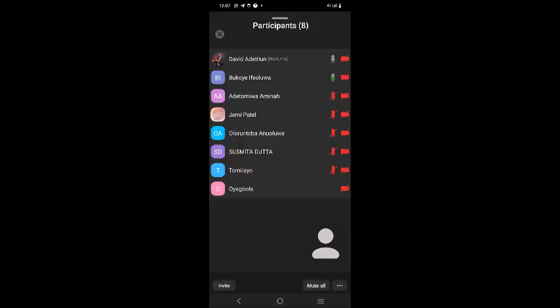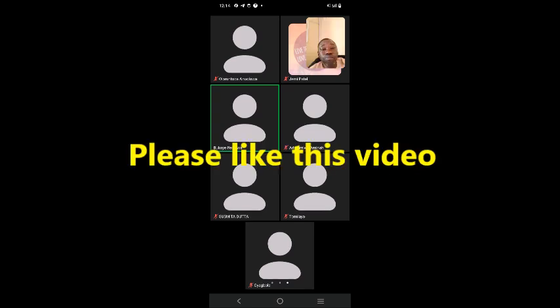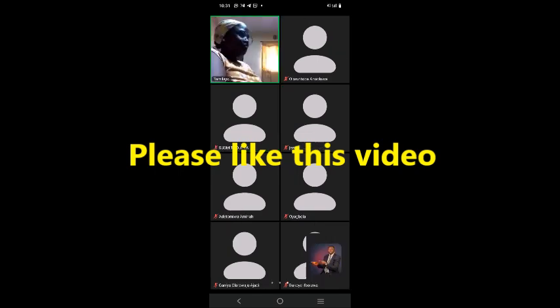Then we have various methods of sterilization. We have physical method, then we have chemical method. The physical method involves sterilization by heat. It can either be moist heat, by applying moisture, or dry heat.